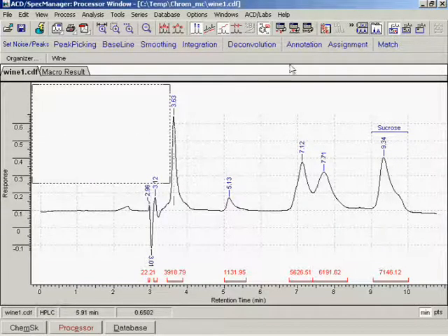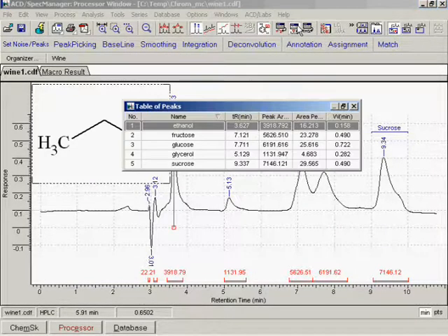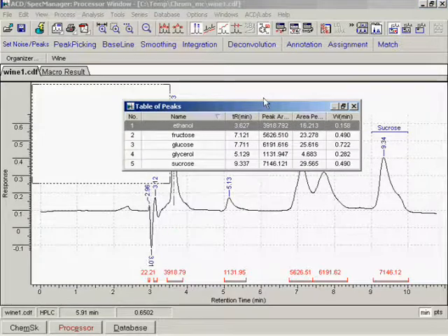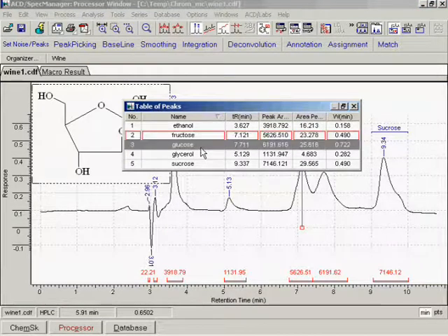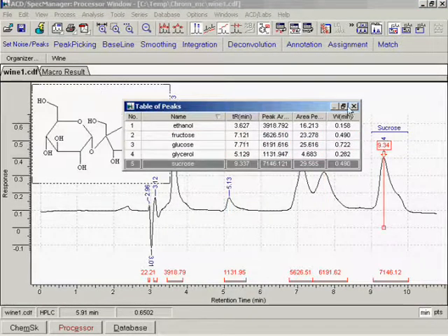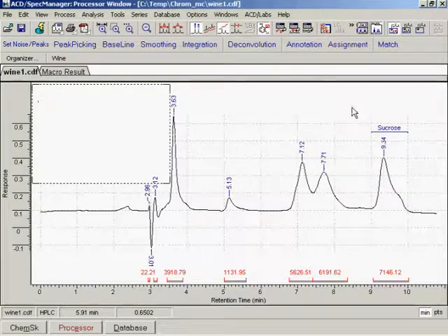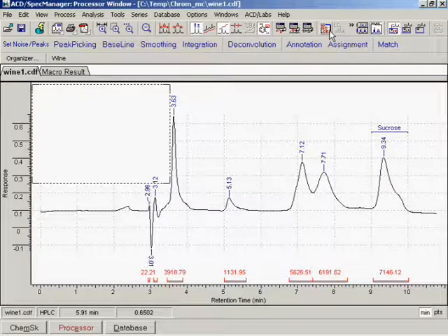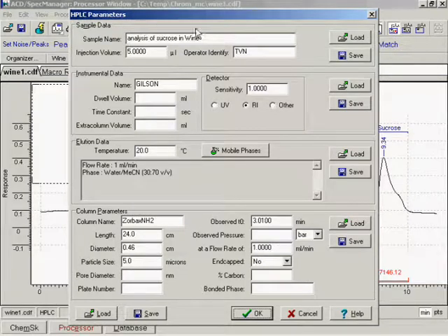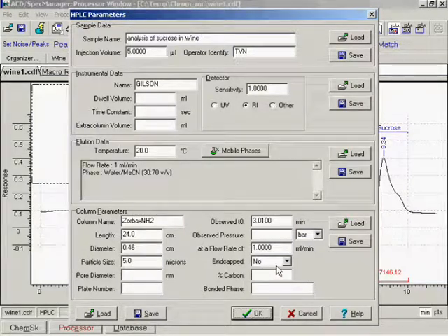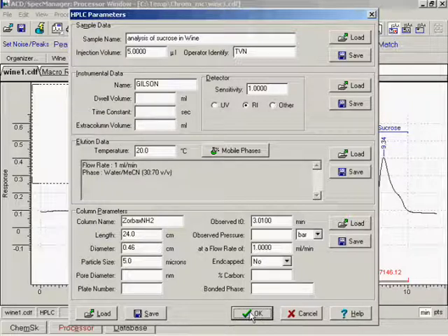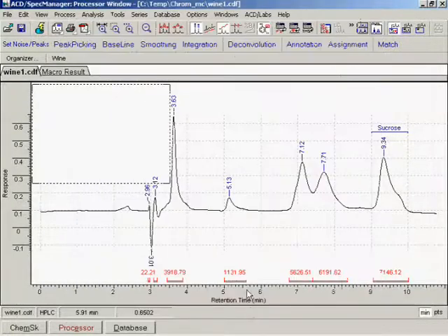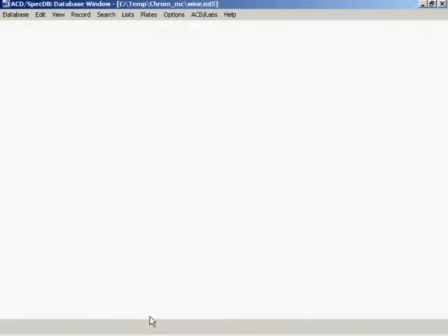The parameters of every peak are displayed in the table of peaks. View the HPLC parameters. The results of the macro processing will be stored in a database.